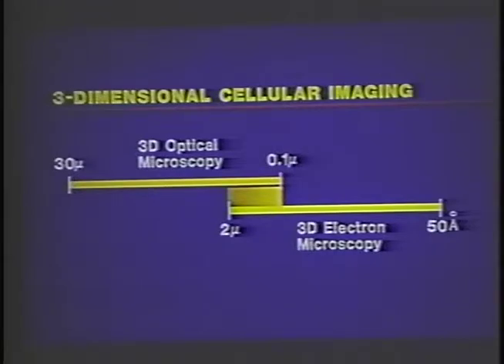Okay? So that you can, at the very least, for example, look at dynamical properties in the light microscope and then transfer the information to much higher resolution in the electron microscope. The actual limitation that's listed here of approximately 50 angstroms for this sort of tomographic analysis really comes from the preservation of the specimen itself and the kind of electron doses it suffers during the analysis. The kinds of things that I'm talking about are being applied to microscopy of intrinsically non-crystalline specimens.